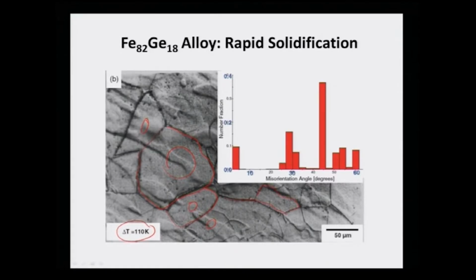And if we look at it, most of the grain boundaries here are shown as a function of misorientation angle, number of grains as a function of misorientation angle. Misorientation basically means one grain with respect to the other grain is misoriented by a certain angle, and that is basically the reason for the grain boundary. We know that within one grain the orientation of the crystal is the same. As we cross over the boundary, we go to the next grain, the orientation changes, and this orientation change is represented by the misorientation angle in the EBSD.